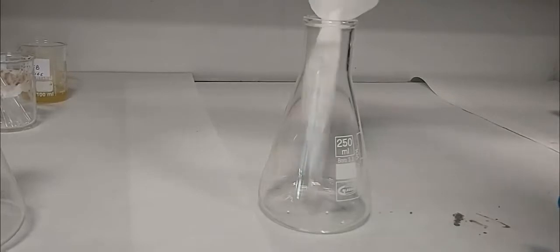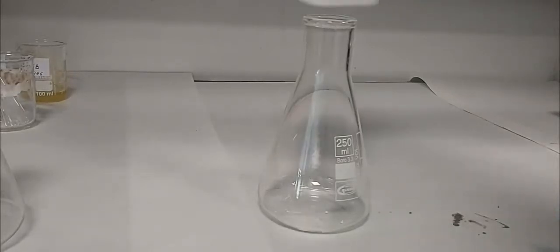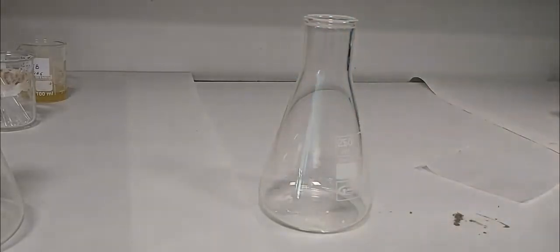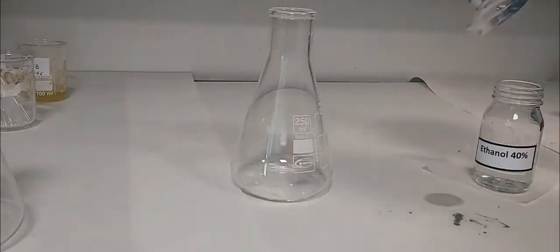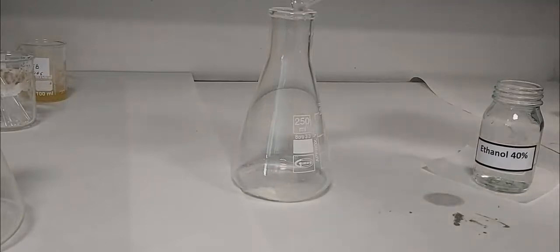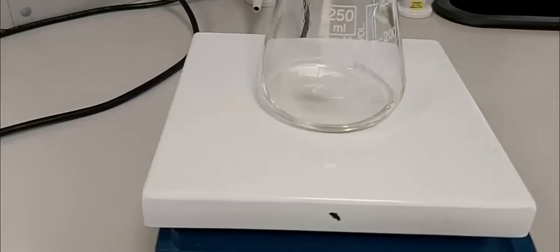The acetanilide is placed in an Erlenmeyer flask with 15 ml of ethanol. We heat the solution a little bit until complete dissolution of the acetanilide. As you can see, the acetanilide is completely dissolved in ethanol.